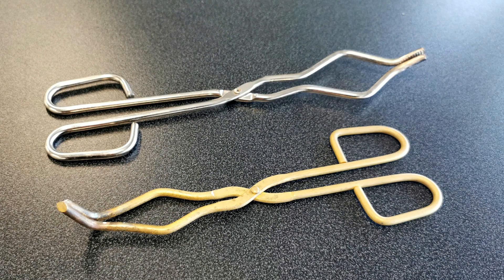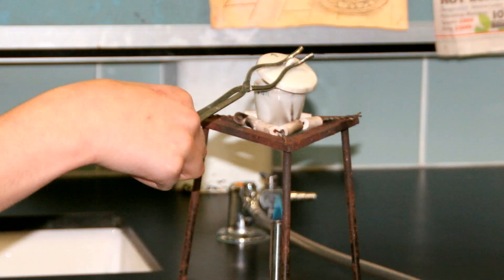These are metal tongs. Some people like to use the curved bit near the end to wrap around a beaker to carry it — I would not suggest you do that. What I think they're great for is the very end, almost like little pliers. Here a student is using the metal tongs to lift the lid off the crucible to check on the heating of the copper sulfate — it's being heated very strongly over the Bunsen so it's very hot, so we use the tongs to move the lid.